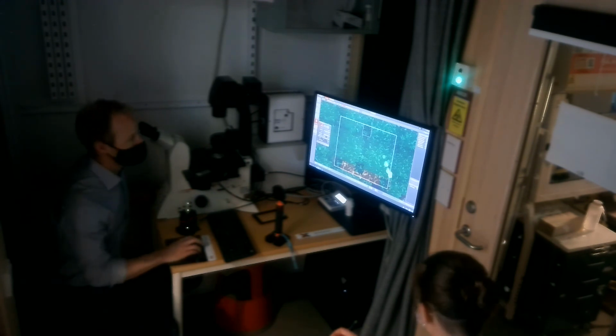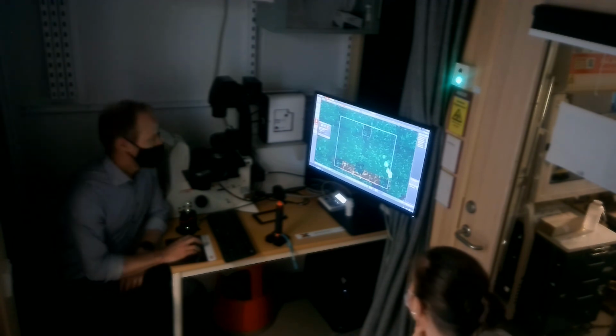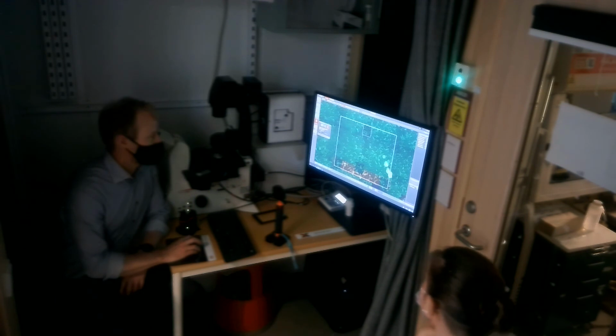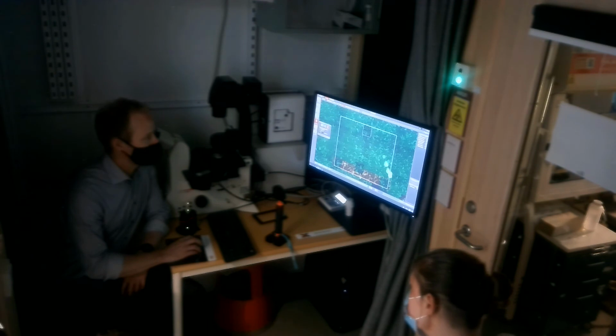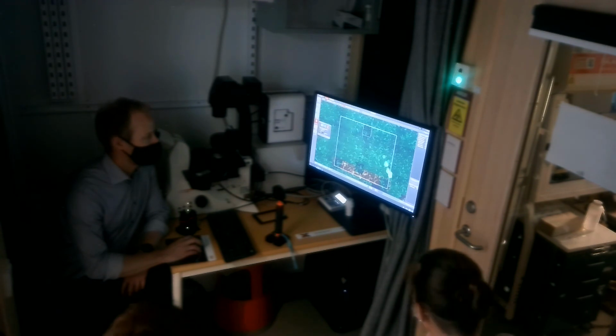The other thing, now this is a stage experiment, so I can go into the stage settings, and here we have the next one. Should I look for the focus just in the first position? Or should I do it in every position? Or every third position, for example? That's up to you to decide how often you need to do it.